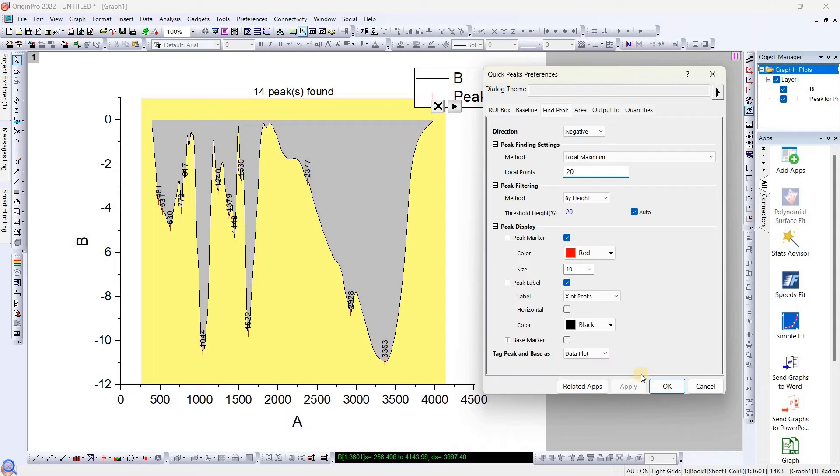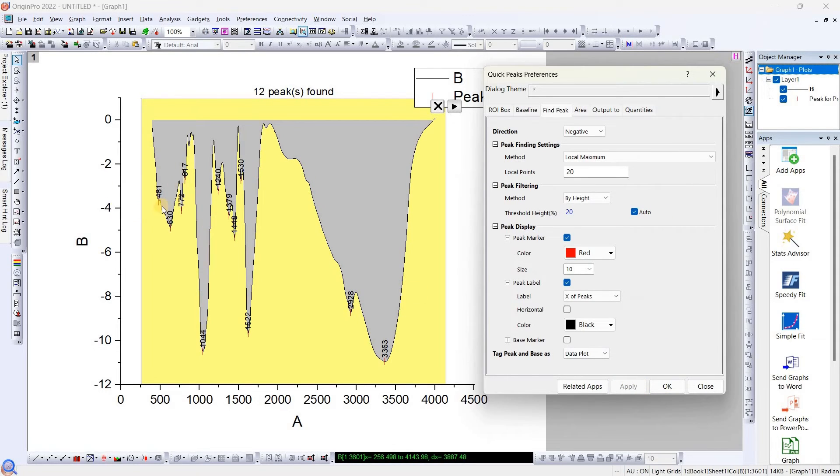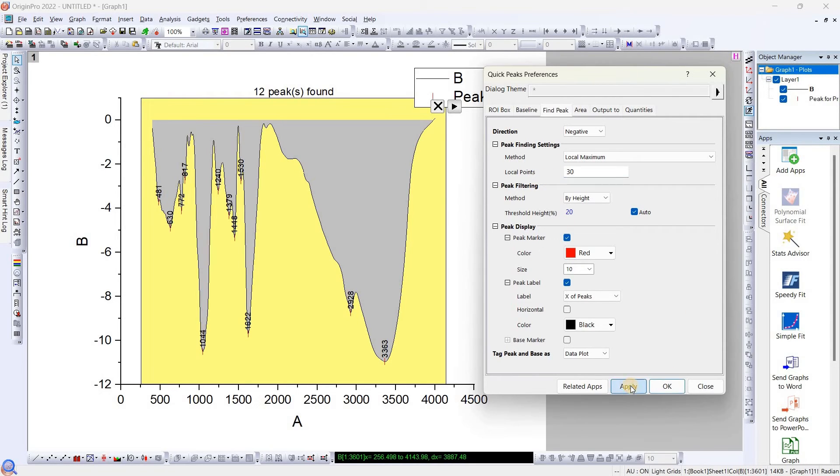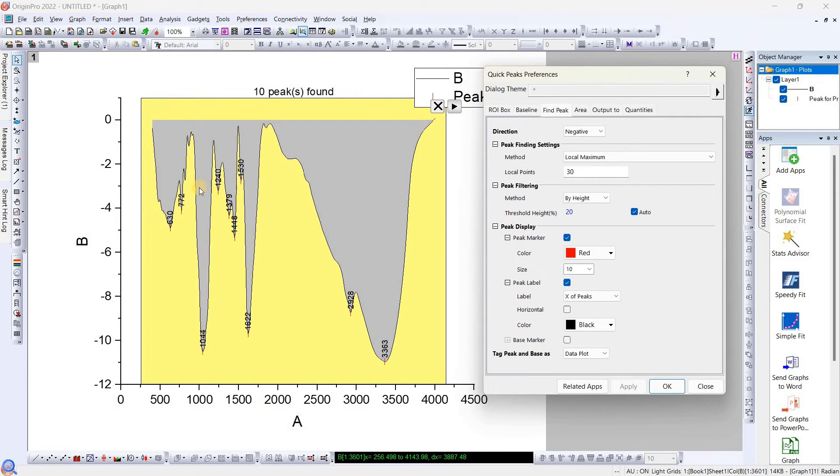So it will avoid those small ripples. Again I will go up to 30. See, now those ripples are gone and they have selected only major peaks. So this is very easy and quick method.